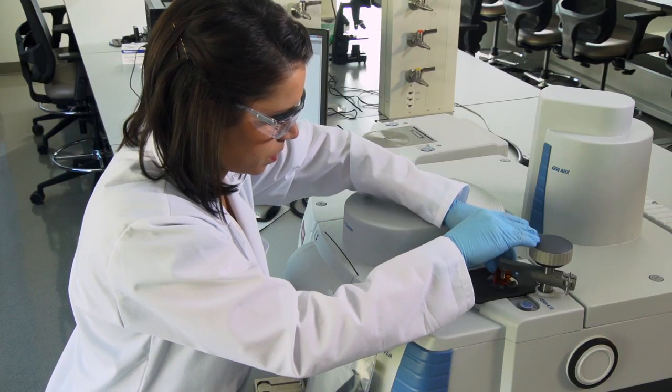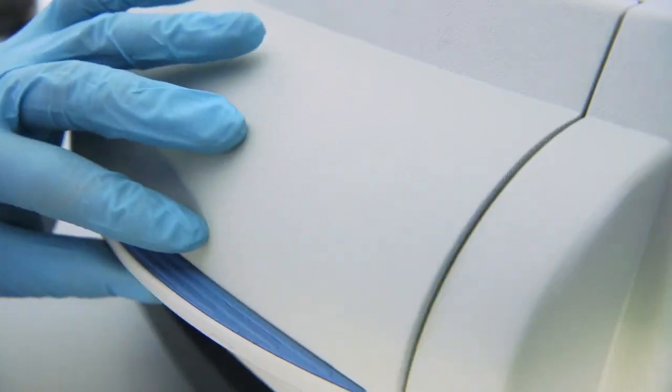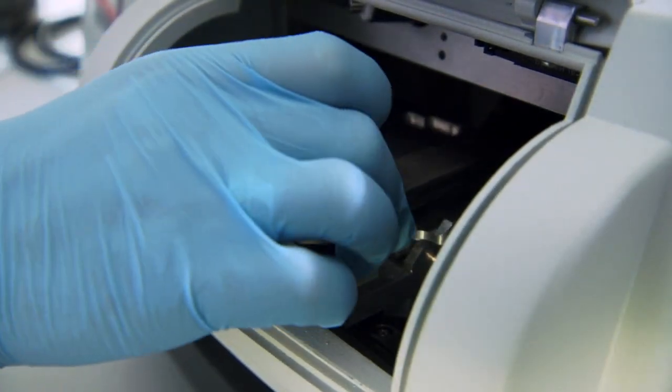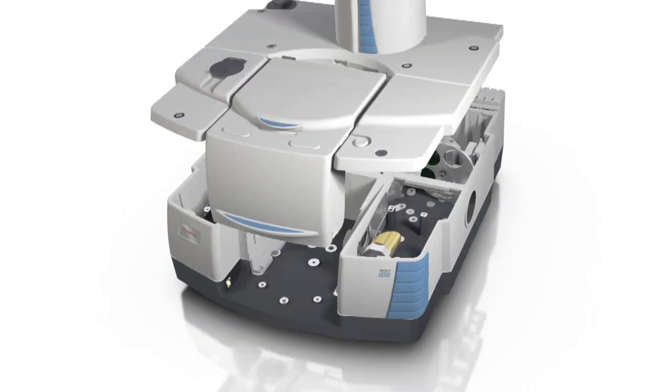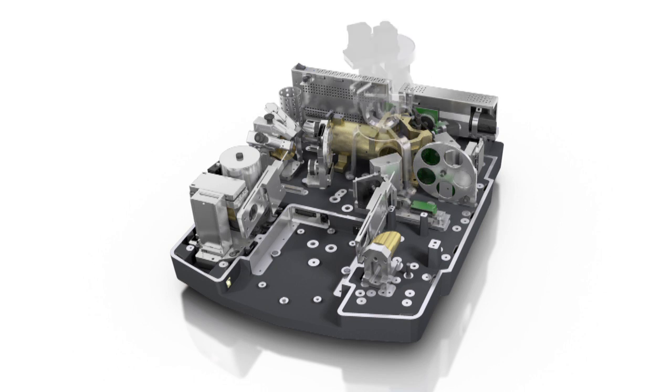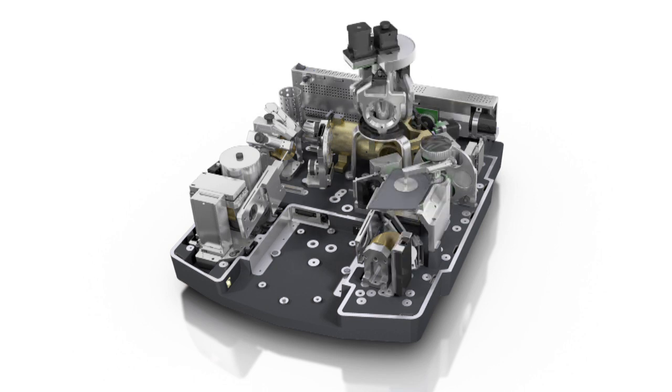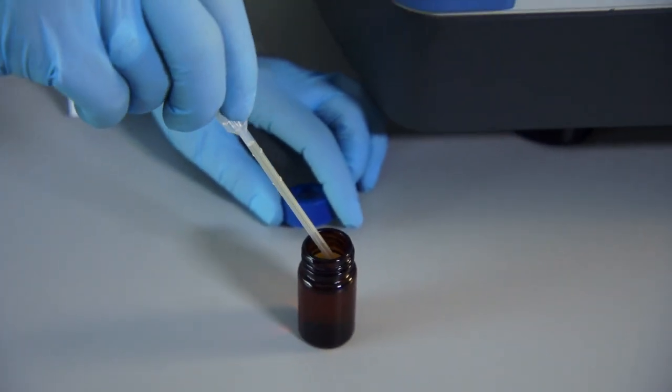Because it easily switches techniques in only a few seconds, the Nicolet IS50 reduces analysis time and cost while providing unprecedented analytical power. Our exclusive touchpoint operation automatically coordinates beam splitters, detectors, and other infrared optics. So you can analyze street drugs, solids, and liquids with the press of a button.